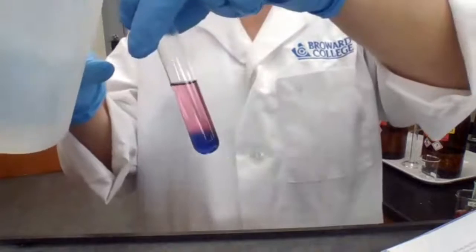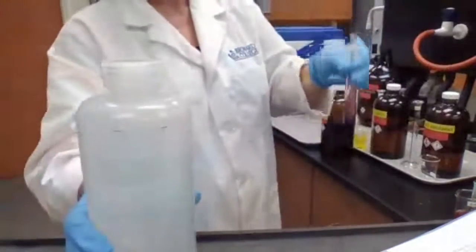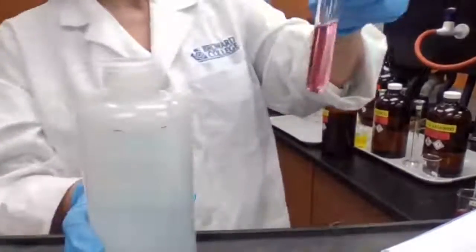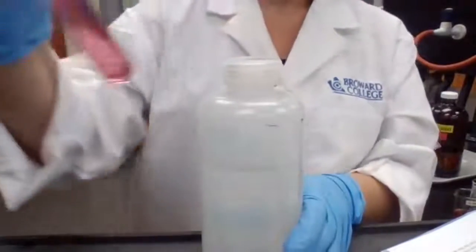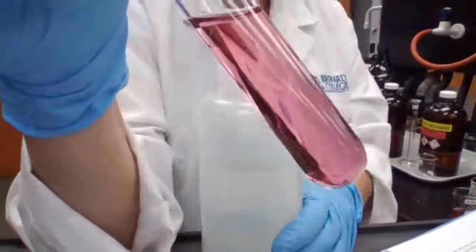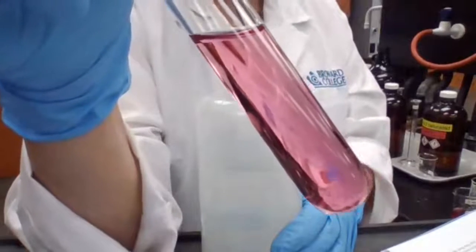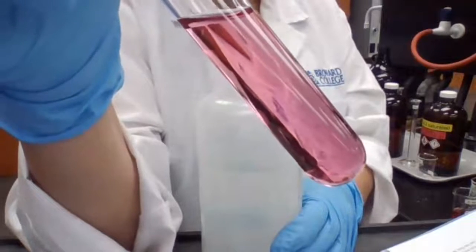I'm going to add enough, and I want you to record the color, what's happening after adding deionized water. This is for part B of the experiment, the cobalt equilibrium.